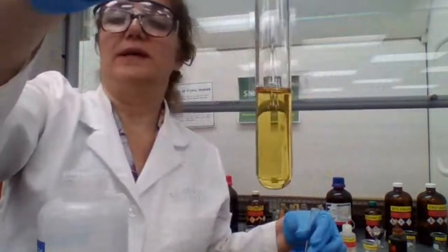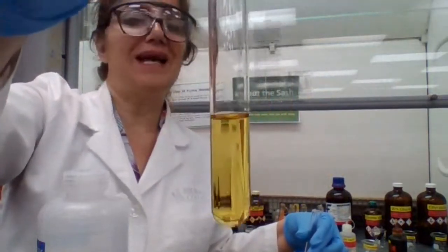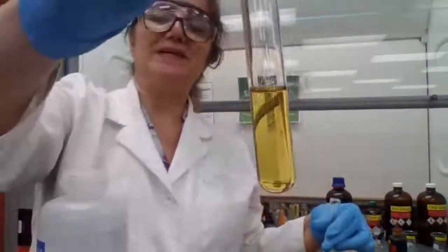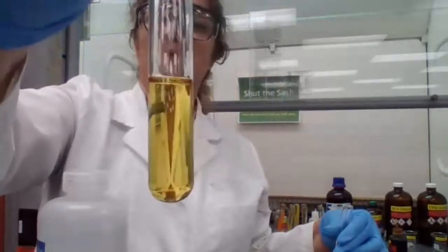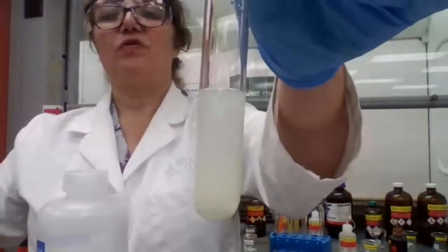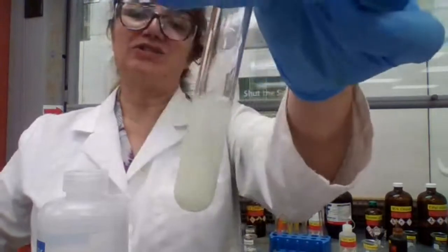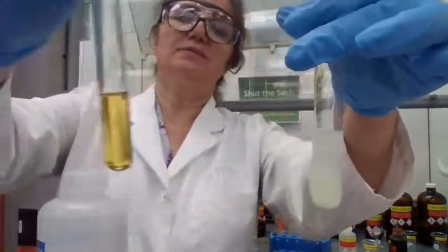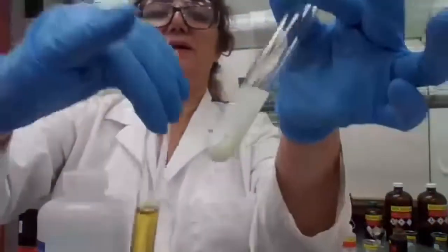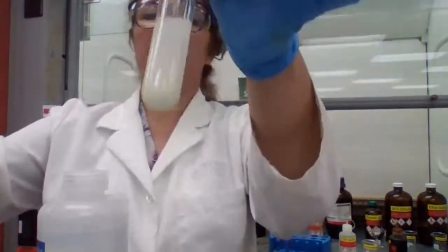Cyclohexanone is a non-methyl ketone. It's not the yellow that is negative. It's the clear that is negative. No precipitate, that means it's negative. Formation of a yellow color precipitate is positive. So it's the texture, not the color. This one is clear, but still yellow color. And then this one is the yellow color precipitate.